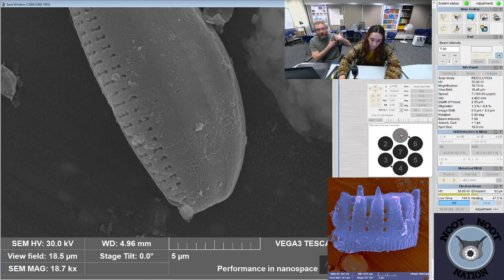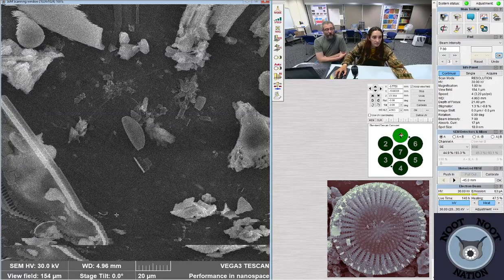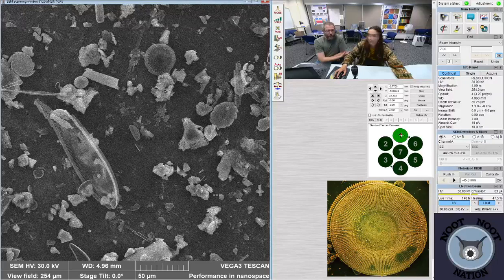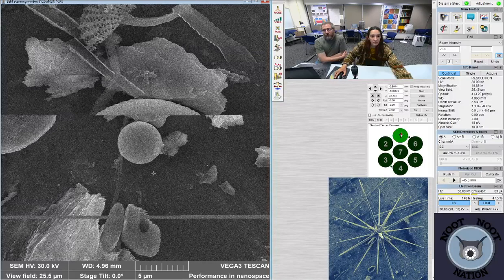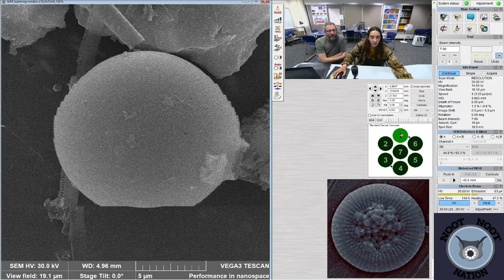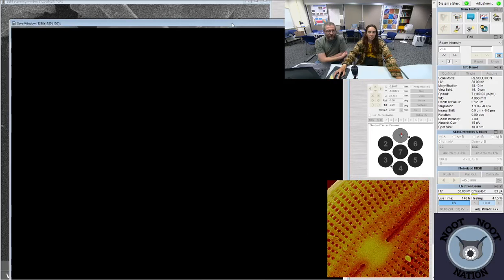In the old days, on the SEM that I learned to use back in the Stone Ages, the sputter coater that we had used gold palladium, which is a really common type of target that people will use to sputter coat samples, a combination of gold and palladium. The cost for palladium is a little cheaper than gold, but if you get gold palladium targets, it usually only saves you like $100. Might as well get the gold. I think there's a reason people use palladium for some of the other purposes for an SEM, like elemental analysis, but for our work, it doesn't really matter.